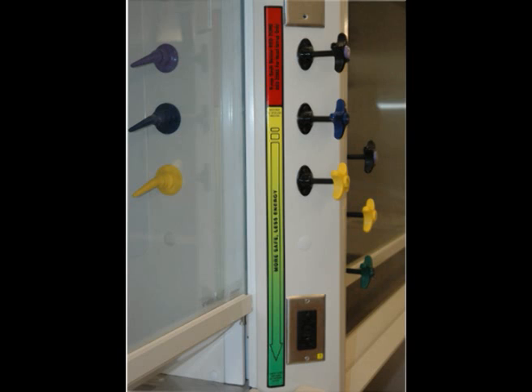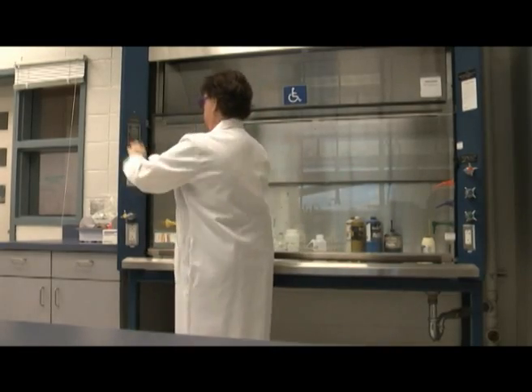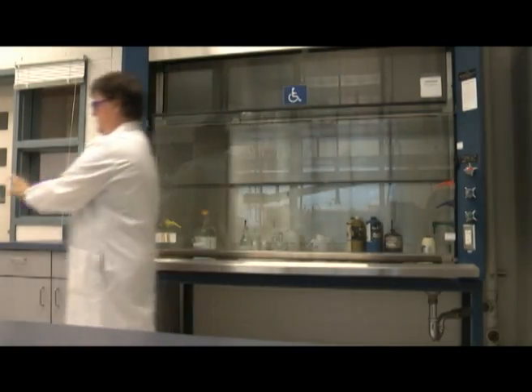Most fume hoods now have this label on the sash frame. Be sure to use the sash in the green zone as much as possible. A sash should only be in the red zone for equipment setup. When you are finished with your work, be sure to lower the sash to save energy and protect lab occupants.